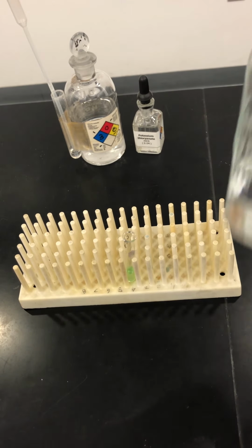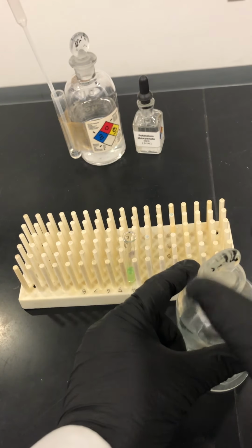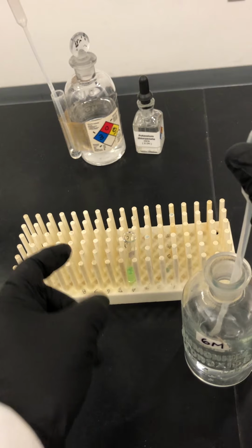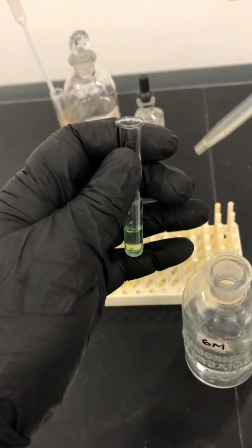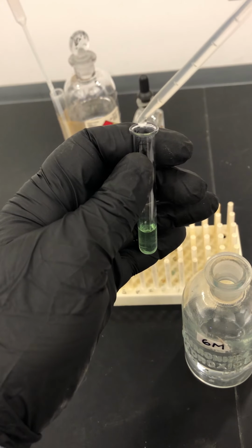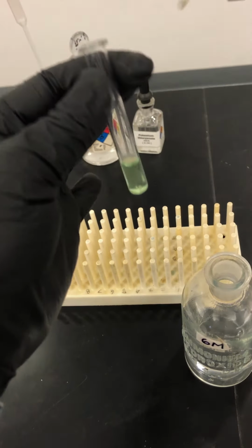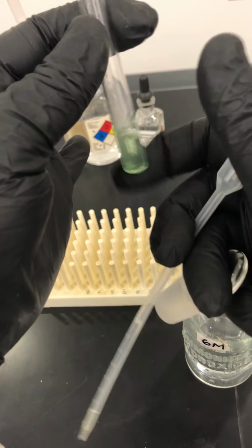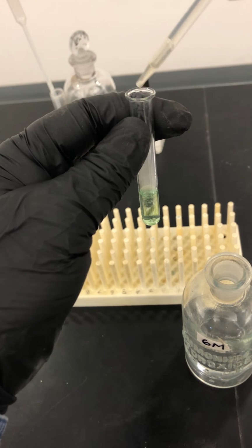All right. So here is, again, my ammonia. Remember, in aqueous solution, it's ammonium hydroxide. And I'm going to add it drop-wise because I want to make sure that I get the full effect here. So here is my test tube, and I'm going to add 1 drop first. I'm going to mix it. Nothing happens. Another few drops, and nothing happens.